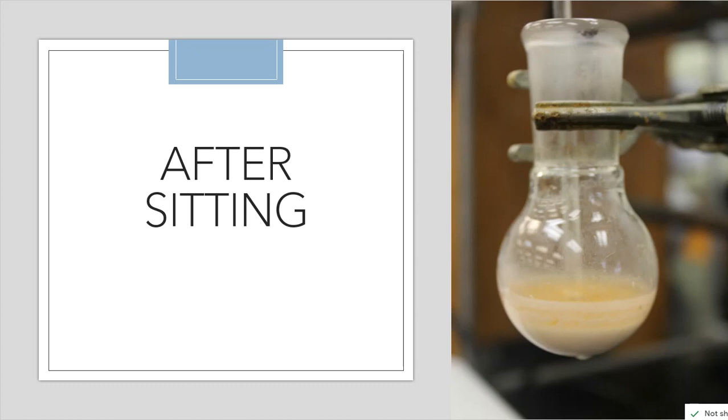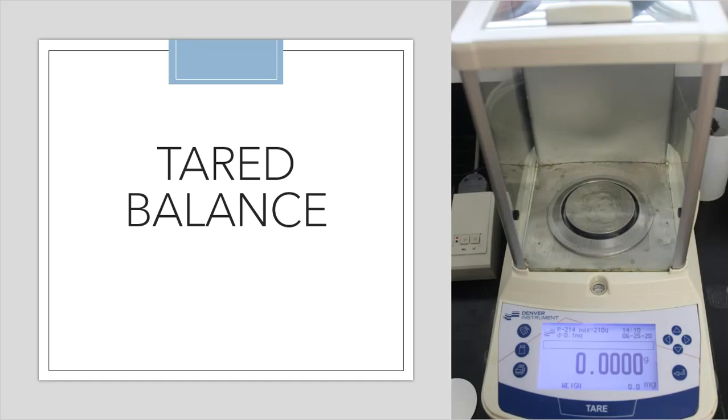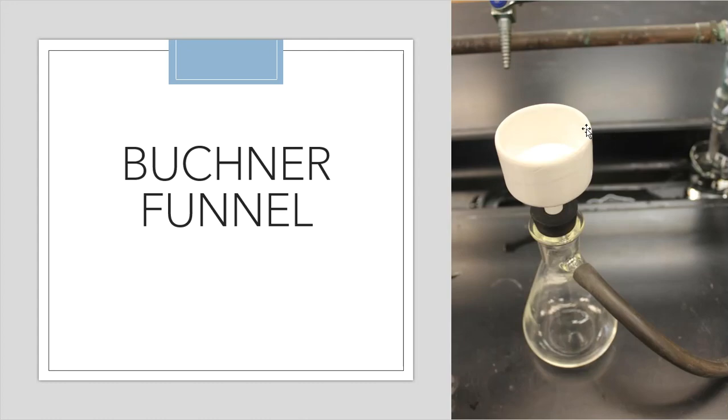All right, so now that I know I'm going to have to filter, I go to my balance and I get this Buchner filter paper, again, 55 millimeter in diameter, and there's the manufacturer of that filter paper. It's a Whatman filter paper. I go to the balance, and I tare out the balance to make it read 0.0000. I put the filter paper on it, and the filter paper is going to have a mass of 0.2092. All right, so 0.2092. I take that filter paper, put it inside of the Buchner funnel, and I turn the water on to create some suction.